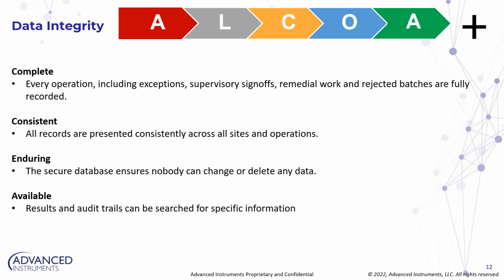But the other thing within available is the fact that not all data sets are just within the instrument, right? It's sometimes stored, as I mentioned earlier, in your cloud, in your LIMS system, or just a folder in your network. All of those sources need to be easily available, but also ensure that in that availability, everything else we talked about with ALCOA applies, right?